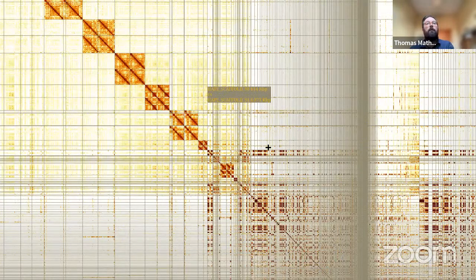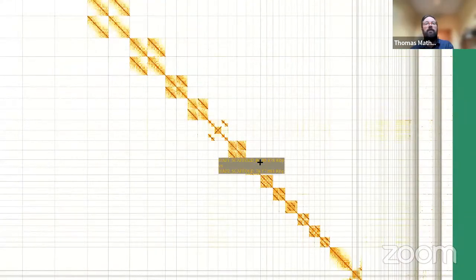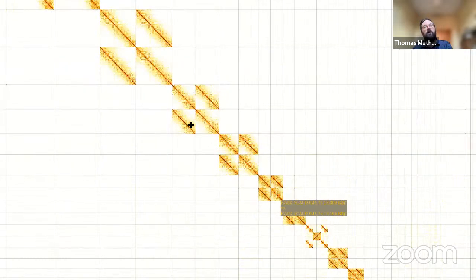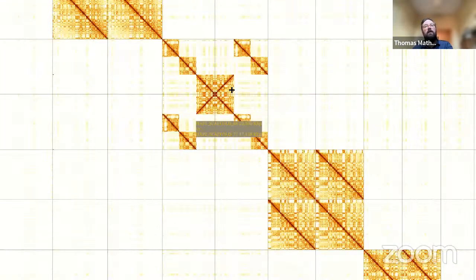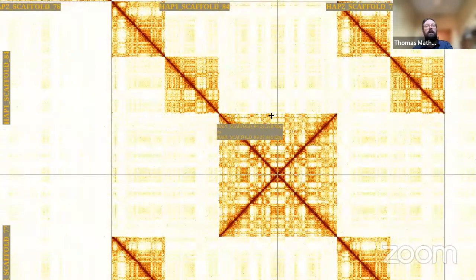Moving through. So this piece here, we've got a piece in the middle here, which belongs over here. We can pick that up and place it with this piece of W. Just check, there's another set of these chromosomes. So these are some larger macrochromosomes, which have this lower background signal. And if we zoom in here, the scaffolder has joined three chromosomes together. You can see this very sharp drop-off in Hi-C signal here and here.